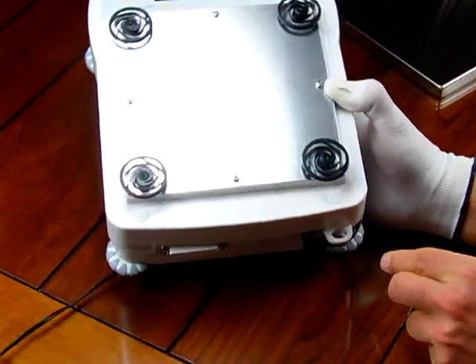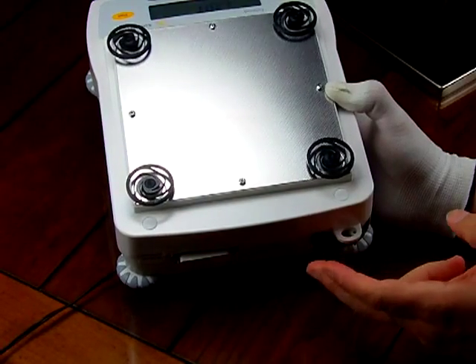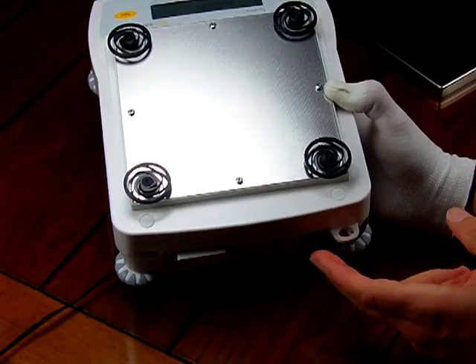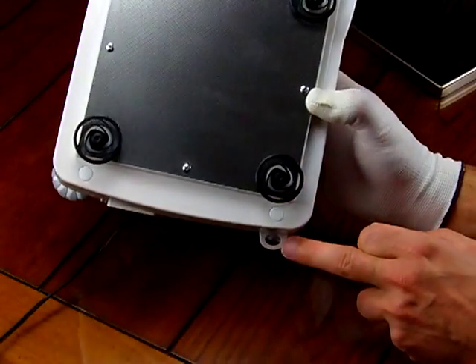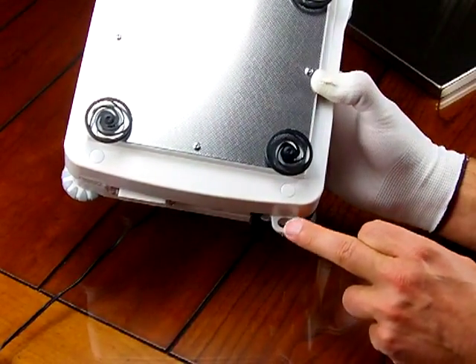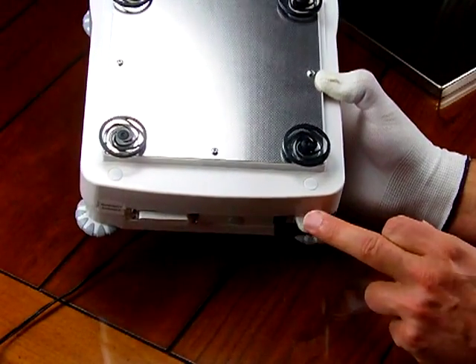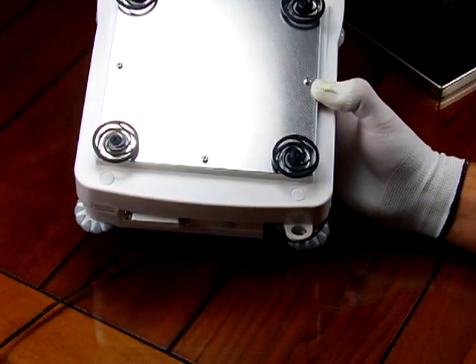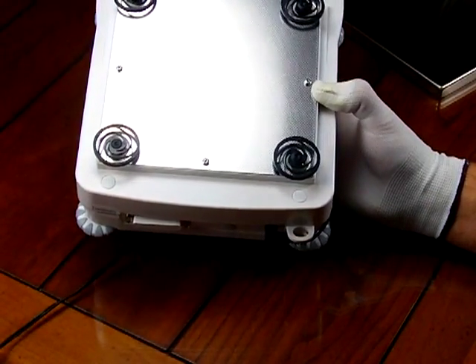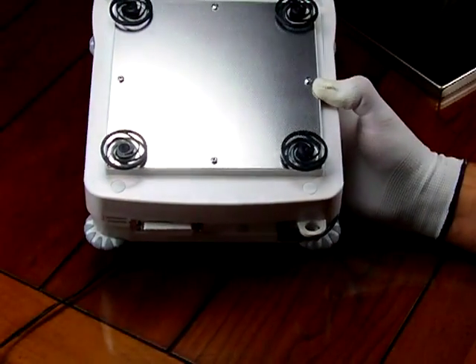On the rear there is also the AC adapter — there is no battery on this balance, AC adapter only. There is also a hook on the back where you can put a cable through for a lockdown application — if the balance is in a lab setting and you're concerned about theft, you can put a Master Lock cable through there to secure your balance.